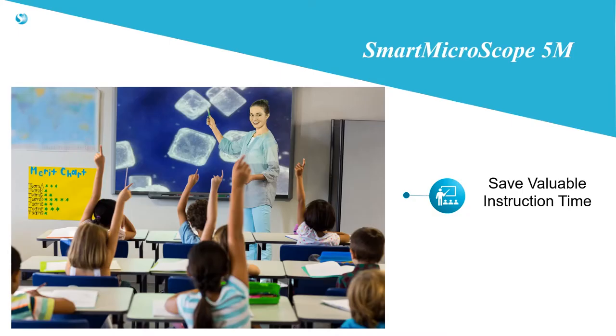The HD resolution image is perfect for projecting for every student to see. Rather than have each student walk by and focus a traditional microscope, the image can be viewed by everyone at once, saving valuable instruction time.